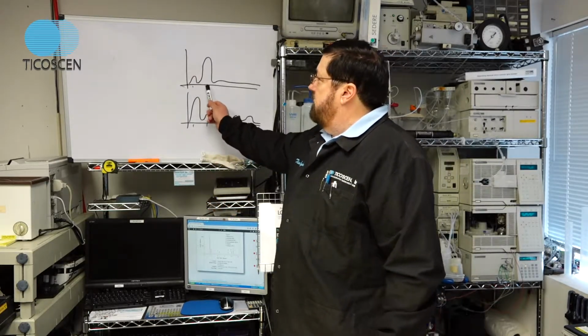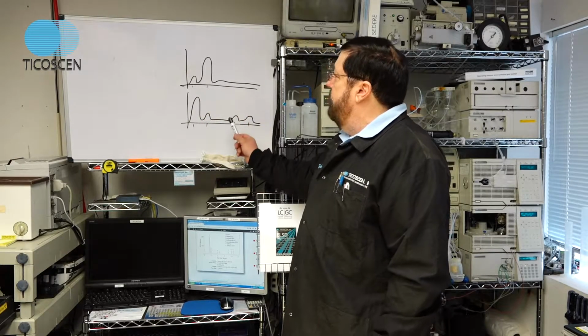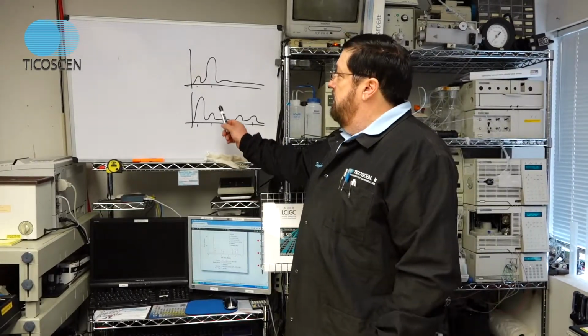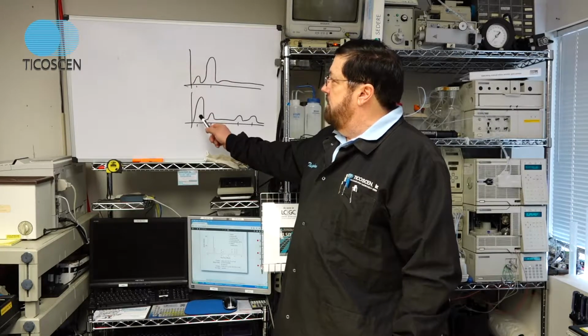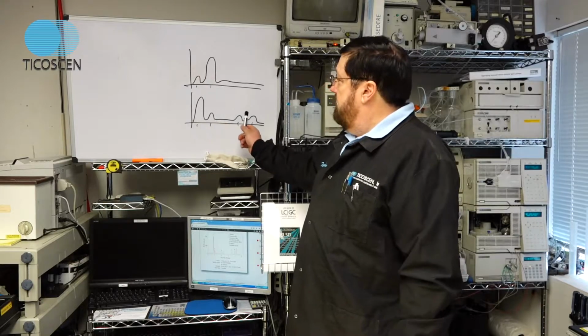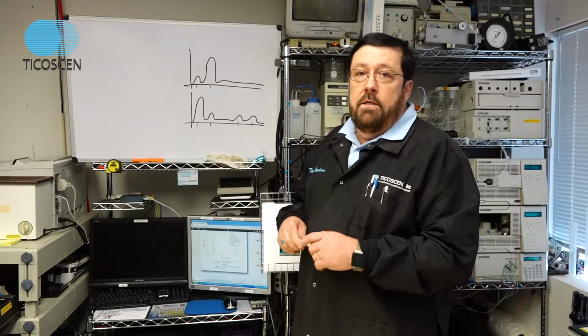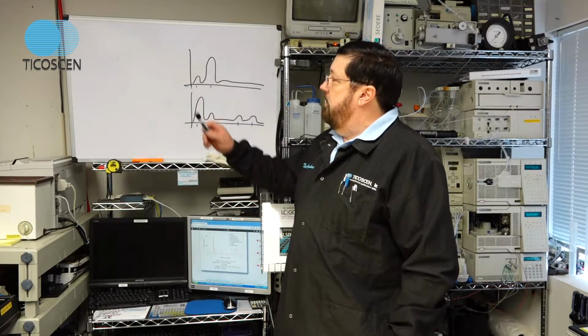And they had 2 peaks of interest at 2 minutes and 4-minute retention time and about a 20-minute run time. We ran that same compound on an ELSD, and we found not only were there 2 peaks transposed in regards to response, because the ELSD is mass proportional and non-specific, we also found 2 additional components in their compound. They did not have a pure compound. And their relative percentages were misleading because of the response on the UV detector.